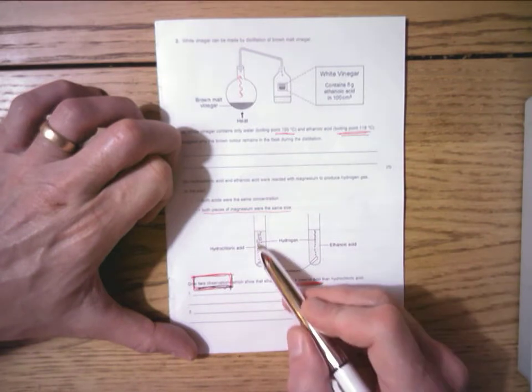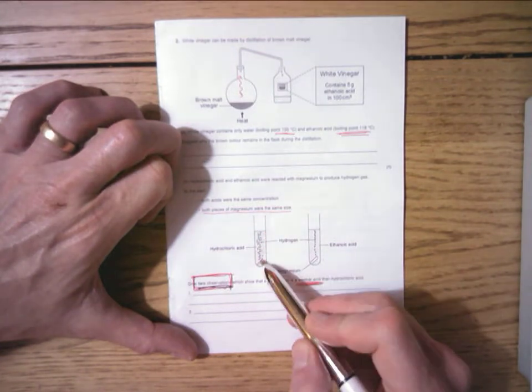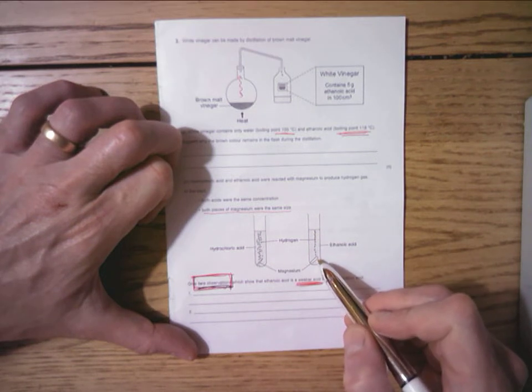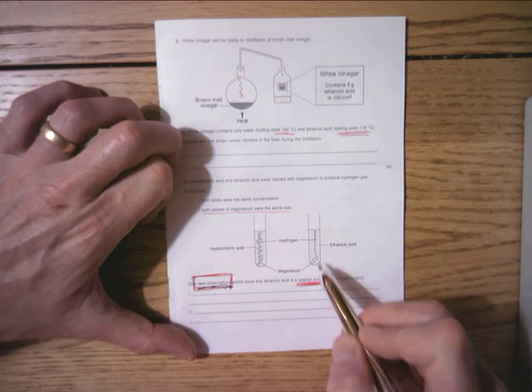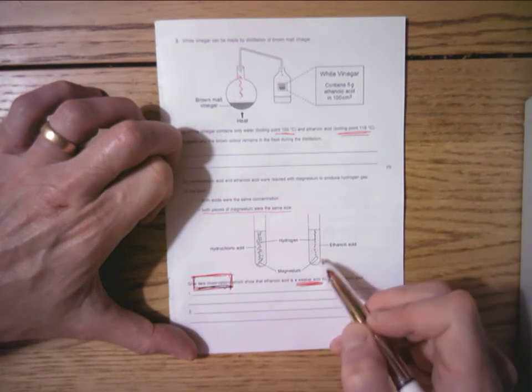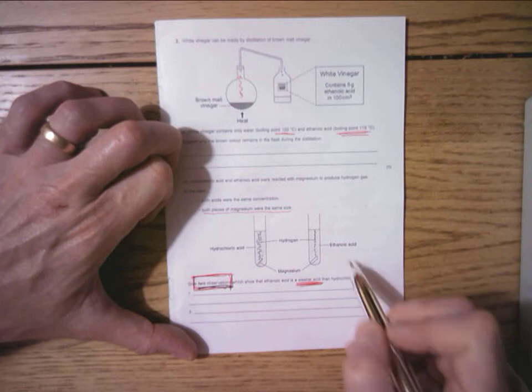Well, look, for hydrochloric acid we've got all these bubbles of hydrogen. For ethanoic acid we've only got a few bubbles of hydrogen. So because there are fewer bubbles of hydrogen with the ethanoic acid, it must be a slower reaction, a weaker reaction, it must be a weaker acid.